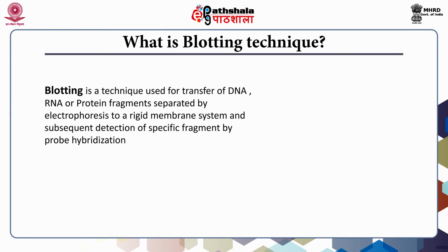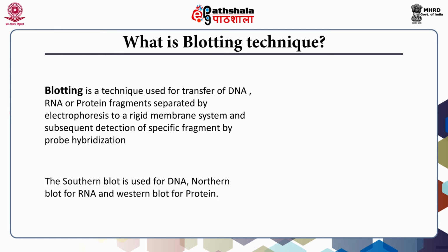Blotting is a technique used for transfer of DNA fragments, RNA, or protein separated by electrophoresis on gel to a rigid membrane system, and subsequent detection of these molecules by using an appropriate detection method. The Southern blot is used for DNA, Northern blot for RNA, and Western blot for protein.